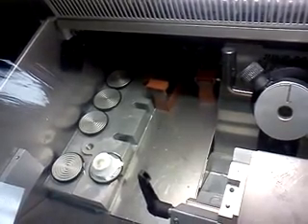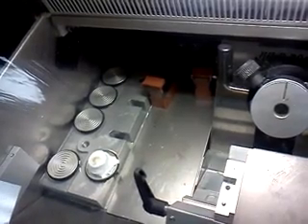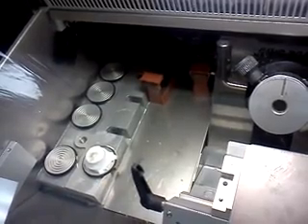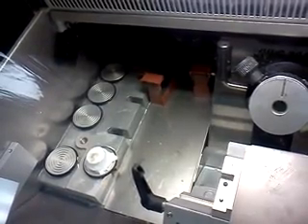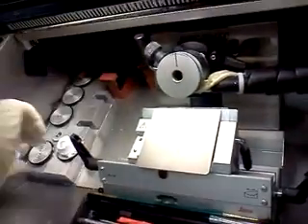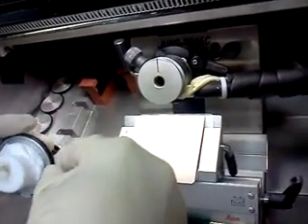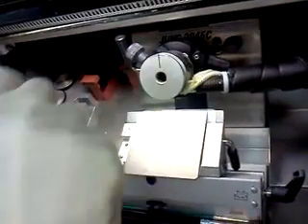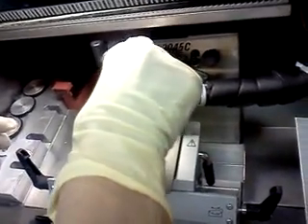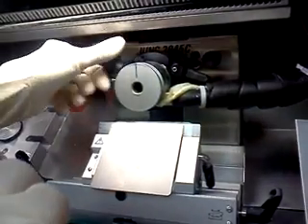So you need to put some kind of a mark on it if you can, or remember in some way where the top was when you do it the next time. Now, this wasn't marked, but it should have been, so that you know what position. Now notice there's a line there. So what would have been handy is if we would know where the mark on here is to match up with the mark on there. But I'm going to guess that it goes in that orientation because that's where the slant is going.